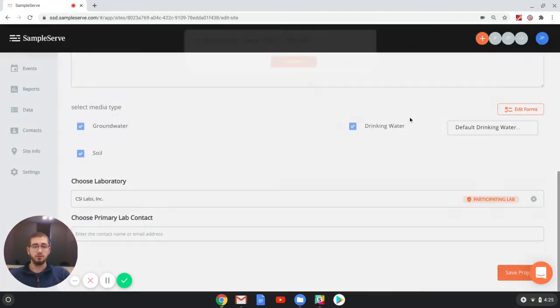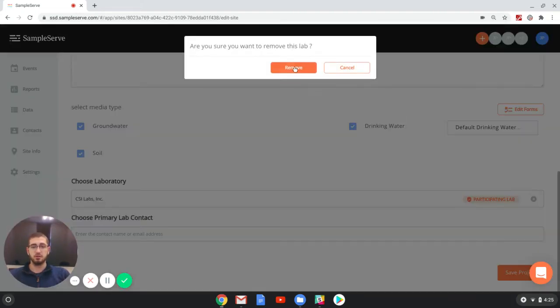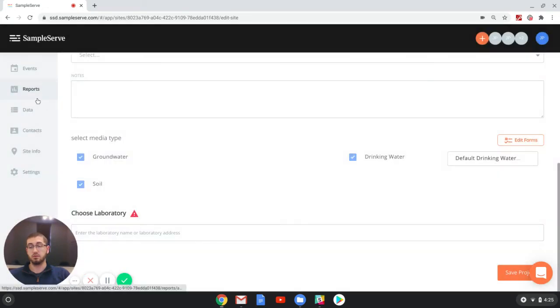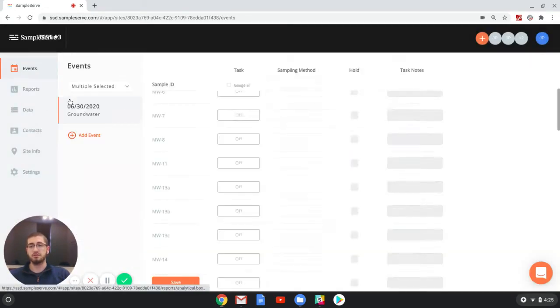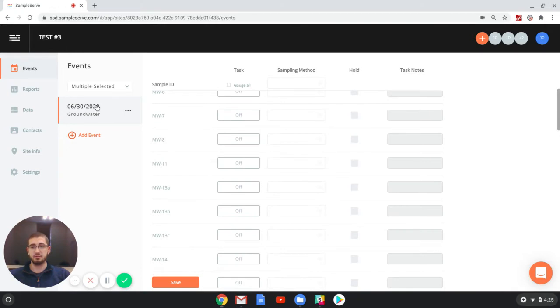However, if you don't know the laboratory you're going to be using, or you use multiple laboratories for a project, you can individually go in for each event and select your laboratory.